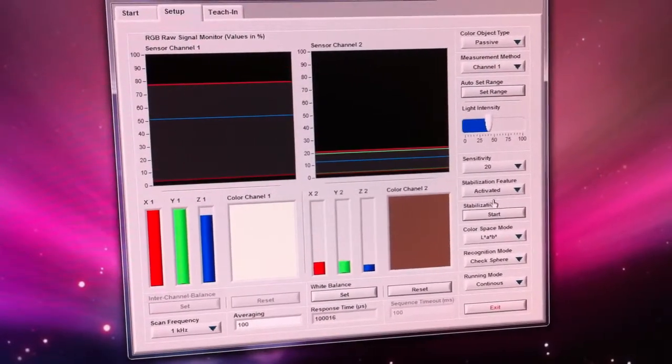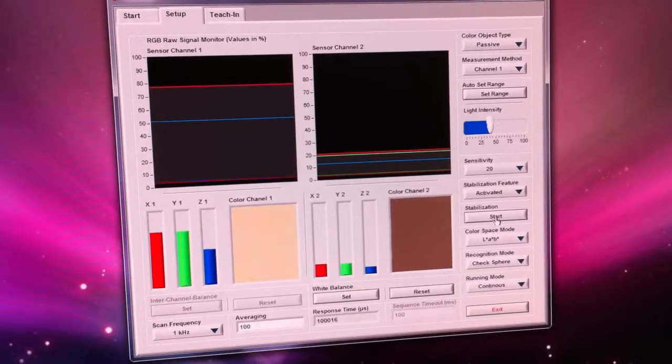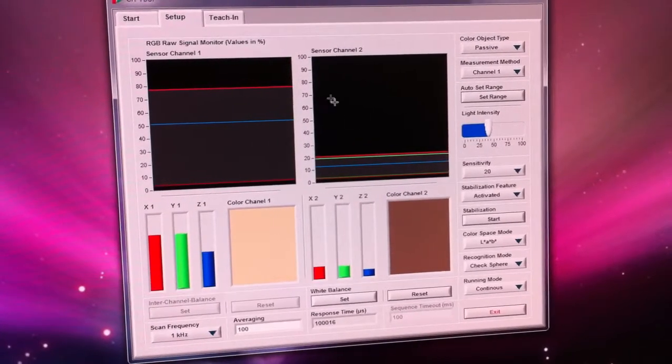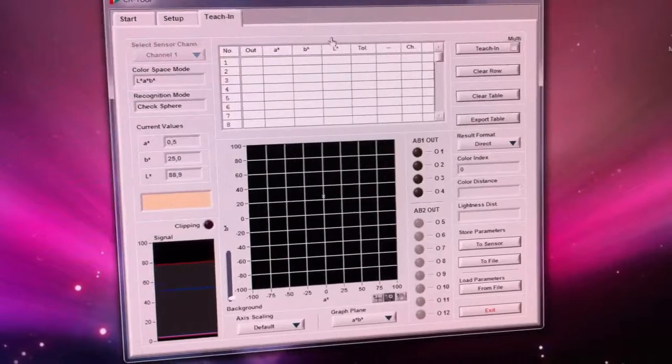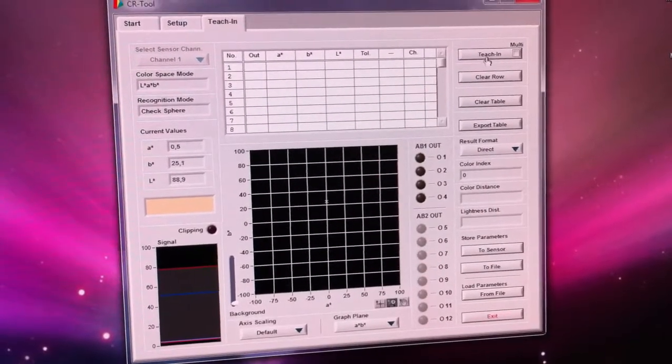Then I adjusted the sensor by the software. The leveling I made in this part of the software and then I took one color value for the pure water.